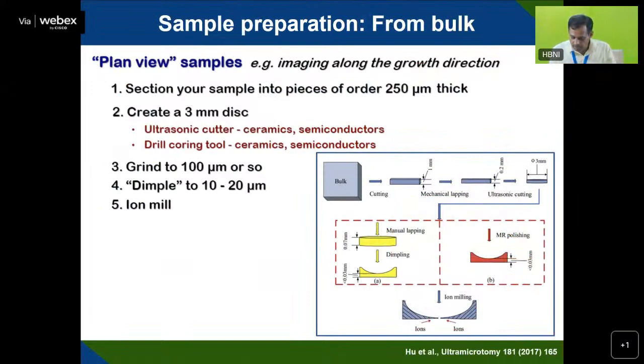And then the important thing in case of TEM is sample preparation. As compared to SEM, sample preparation for TEM is much more difficult. If you have a very good sample preparation, you will be able to see the image in the TEM. Otherwise, you will come out after a 3-hour analysis with no image or a very bad image. You may see a lot of aggregation, or you will see darker images. You will not be able to identify the nanoparticles or grain boundary structure in case of a metallic sample. So sample preparation, you have to take care of properly.